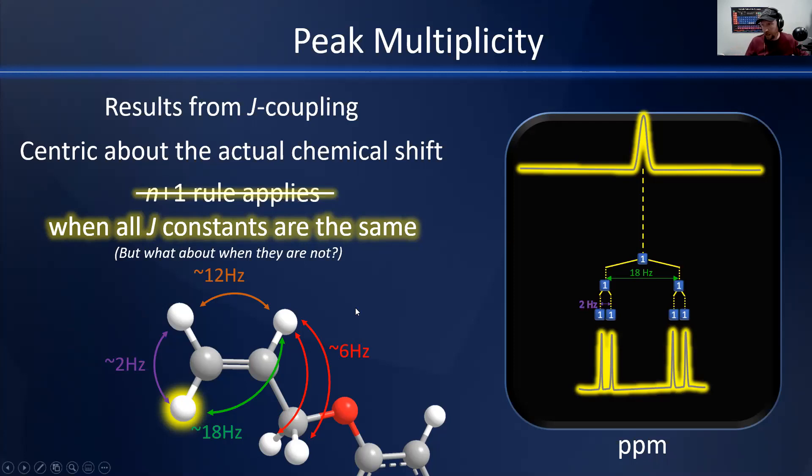The rule for this is we use the term singlet, doublet, triplet, quartet, pentet, and then we're allowed to go to multiplet when things get more complex under the n+1 rule arena. When we are looking at these kind of odd multiplets, we use doublet of doublets, doublet of triplets, and then we go to multiplet. If you look up the rules in the Journal of Organic Chemistry's guidelines for authors, we would have to call this a doublet of doublets, not a quartet.